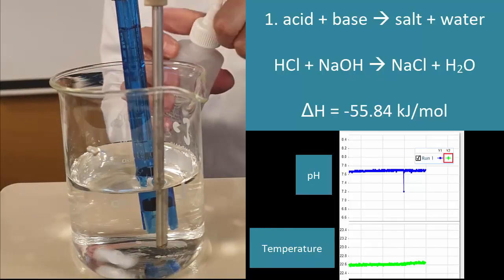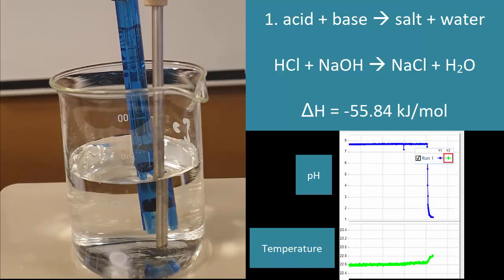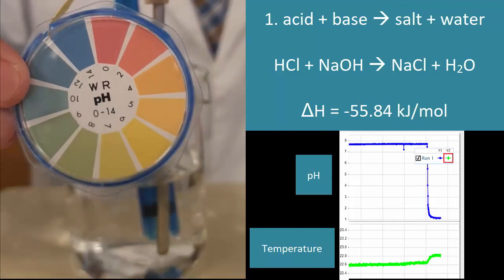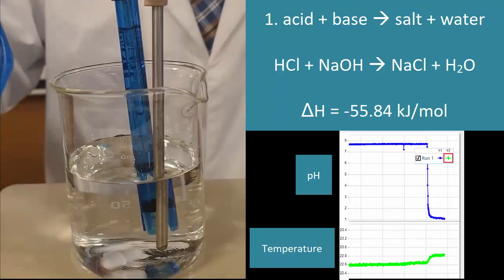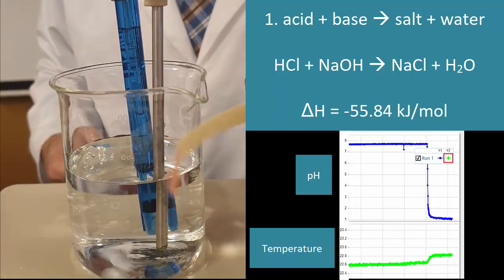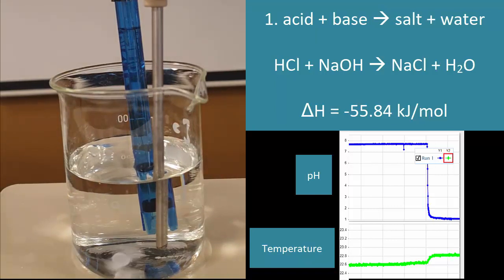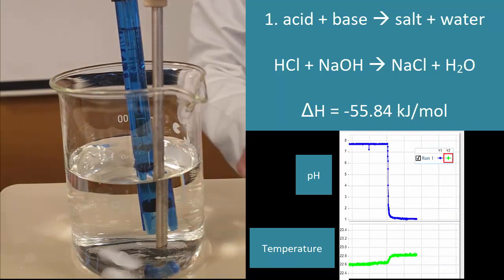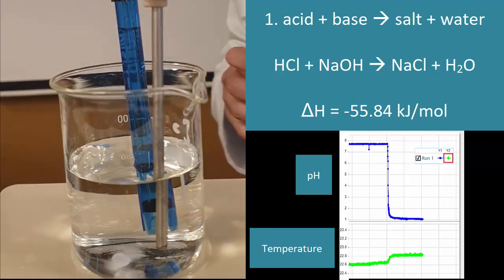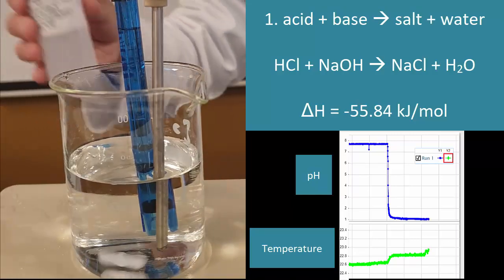And so the first one here is acid plus base gives salt and water. The technique here, by the way, of testing for the acid and the base is not to contaminate it with an indicator, but you can just get a drop out and test it. For an acid, it is pink, and later on we'll test it when we've overshot it, and we've not only neutralized it but put too much in there, so now it's excess sodium hydroxide and basic. We'll pull a little bit out there and test it, and it'll be blue.